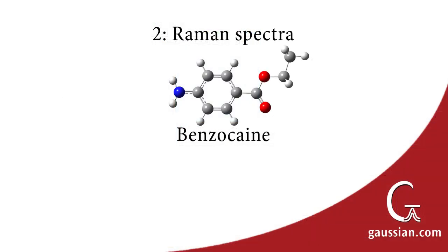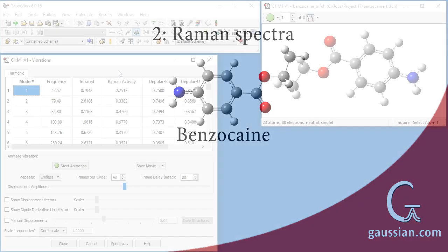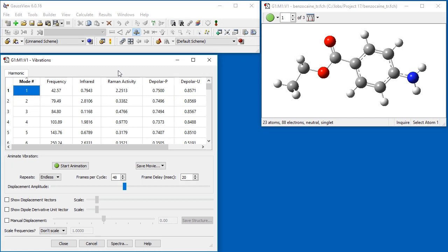We next examine Raman spectroscopic results for the topical anesthetic benzocaine. The mode list in the Vibrations dialog contains several additional columns when Raman results are available. Clicking on any of the column headers causes the list to be sorted based on that column.